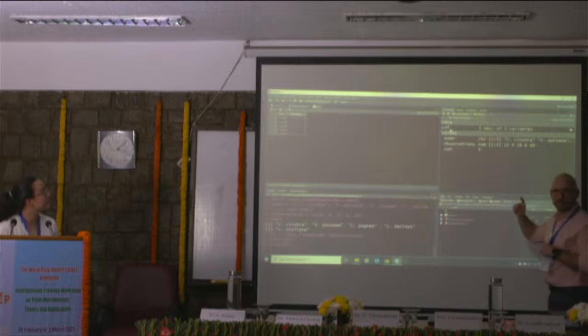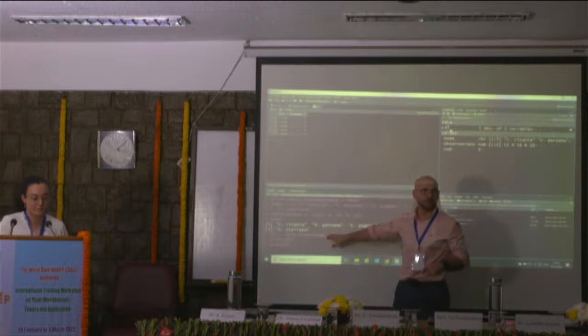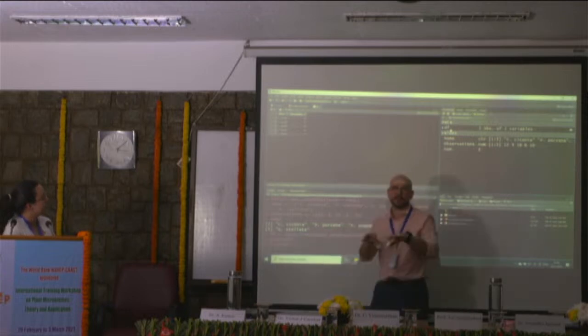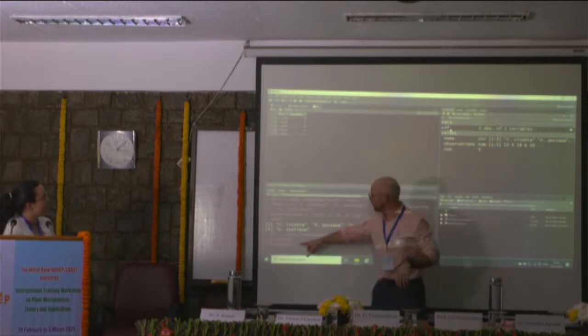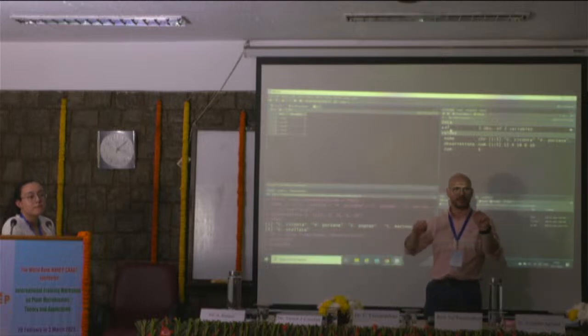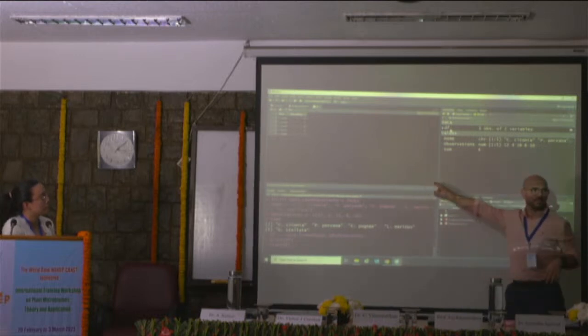Also look here that everything that you do will be printed in the console. For example, if you want to do it by command line, you just do view, brackets, and within the brackets, df, and then this file will come up. Yeah?